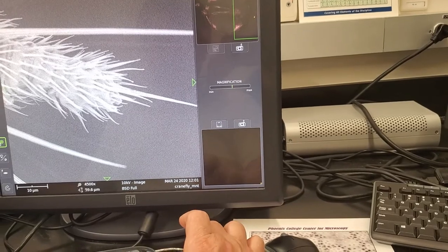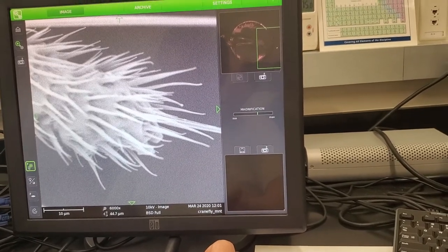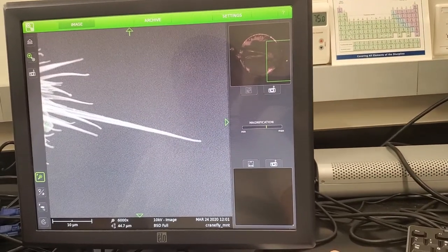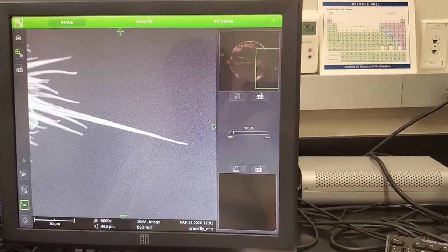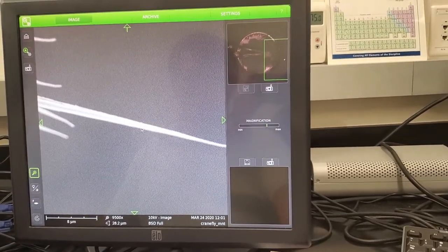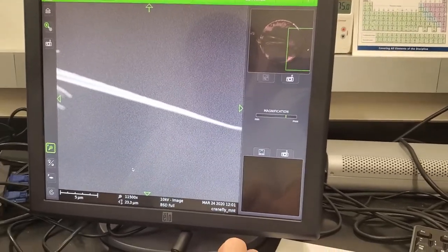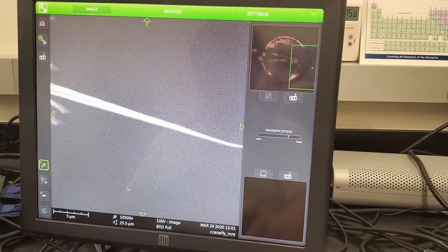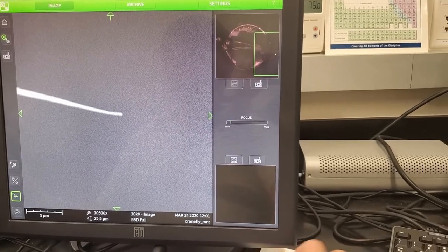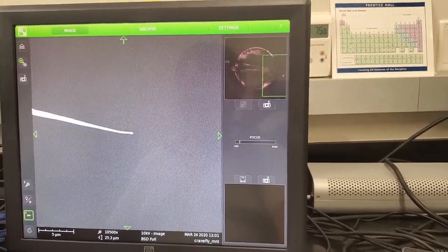Let's go to 6,000x. Look at this sharp image. Let's go to higher magnification — around 10,000x, maybe 12,000x. We've got to be careful because we don't want to burn the sample. Let's go to the tip and focus in. There it is. Take a picture. You guys are kind of living vicariously through me at this point. I wish you guys were with me — this would have been fun.